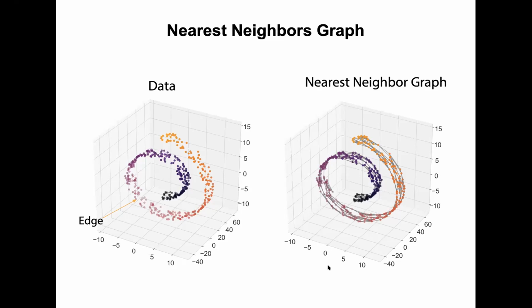Somebody asked, when choosing a distance metric, do you want to maximize or minimize a factor, like the affinity graph that was presented in lecture earlier? So usually one thing that can turn out to be important is to have a lot of variation in your data. Usually people use one of a few different distances, like Euclidean or cosine distance, which pays more attention to the angle rather than the magnitude. You can use cosine distance if you think that things can just be scaled up, if 1 is the same to you as 10 because the ratio between the features is the same, so you don't care about the magnitude.